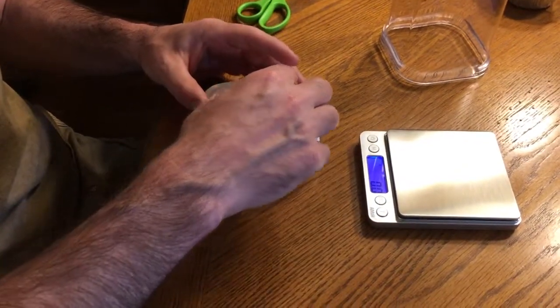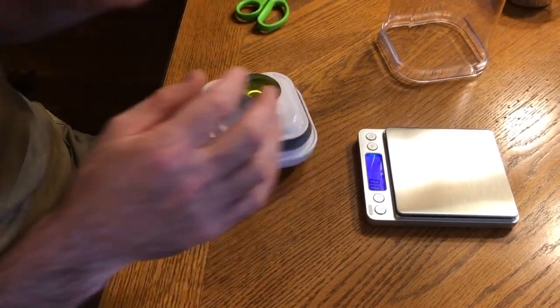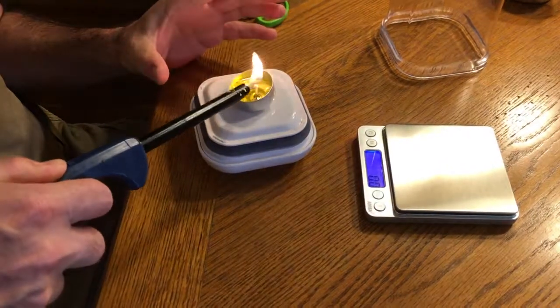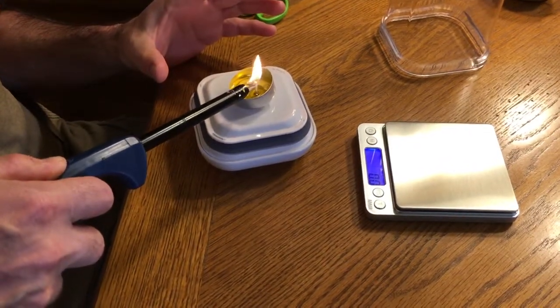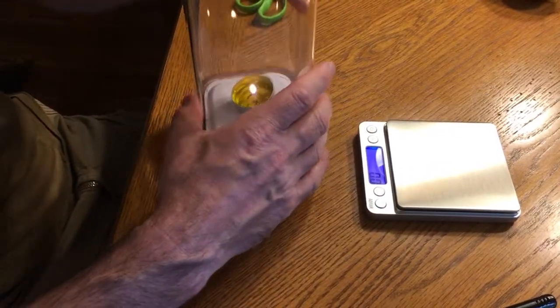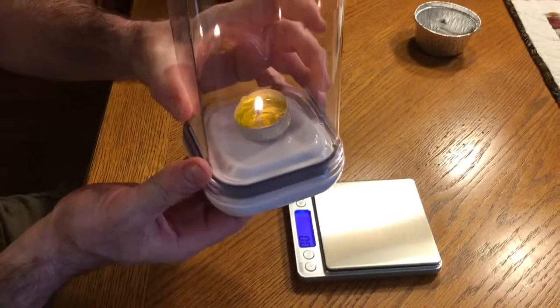And then place that there. Then I'll light this. And then to seal it, you put it on top. To close the back side, you have to get your hand underneath and push the button.